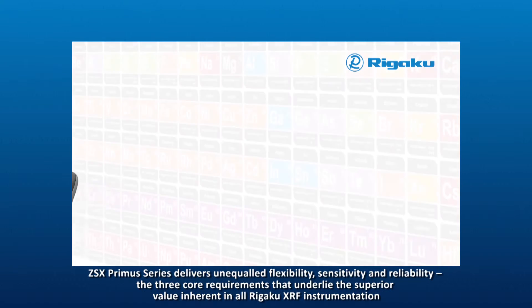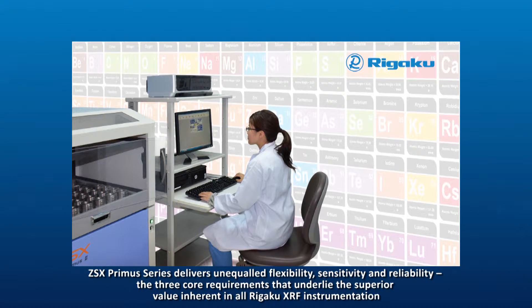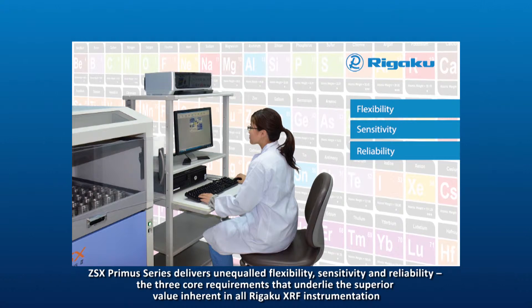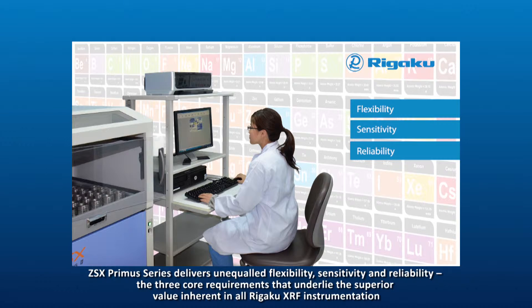With or without standards, the ZSX Primus series delivers unequaled flexibility, sensitivity and reliability — the three core requirements that underlie the superior value inherent in all RIGAKU XRF instrumentation.